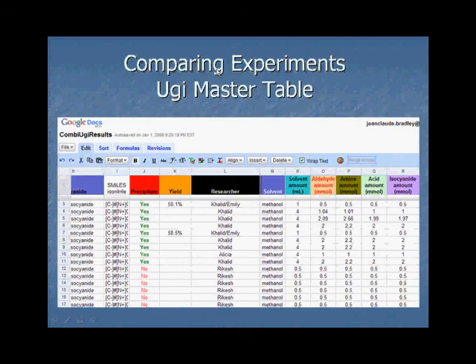Okay, so now if we want to use this information in a much more meaningful way, we want to be able to compare different experiments. And as you keep doing experiments, it becomes more and more difficult to keep in mind everything that's been done. So again, we're using tools as they become available to us. If somebody comes to me after my talk and volunteers to run a database with this, I'd be very happy. But right now we're using Google Docs because it's simple. We don't have a lot of results to track, and so it makes sense. But of course, at some point it should be imported into a real database.